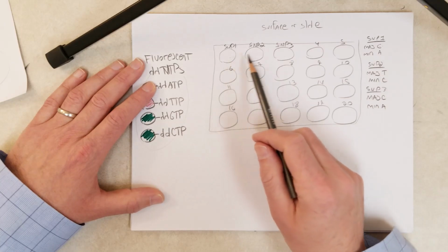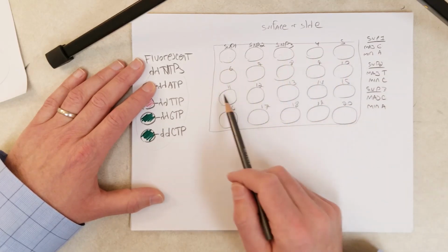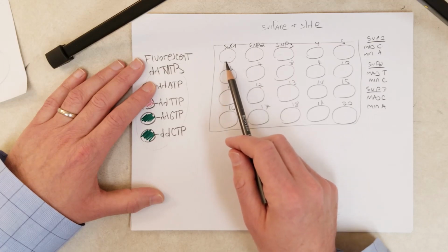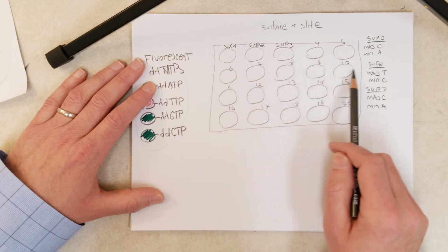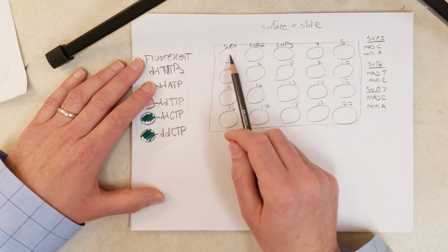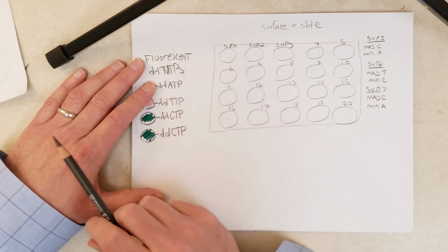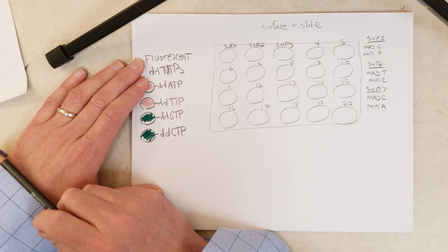We can even denature these again, raise the temperature and get rid of the annealed DNA, and wash all that off. So the only thing stuck now are the SDOs that are covalently linked to the beads. And each SDO has been extended by one fluorescent nucleotide.